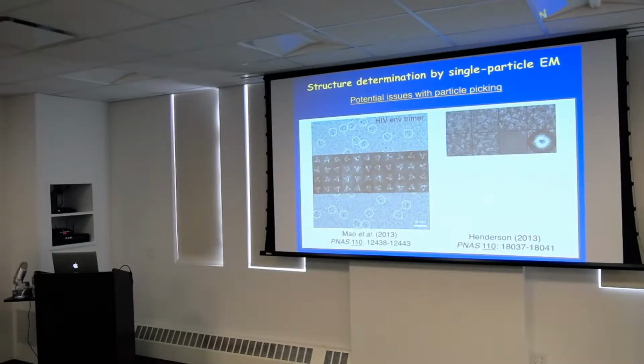And so a whole bunch of people started to analyze this data. This is from the analysis by Richard Henderson. These are just 6 of these particles. He added them together without any alignment. And if you change the contrast, you can actually see the particle. Then you have this very strange black ring, and then you get to the background intensity. This should never happen if you just have normal particles. So from these little averages, it's immediately clear that something is totally wrong.